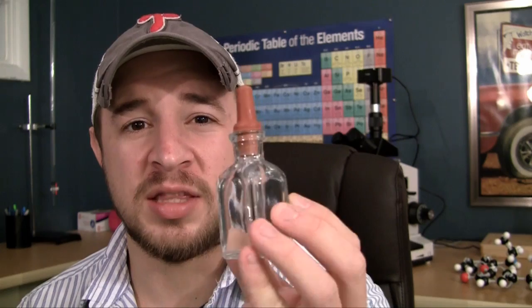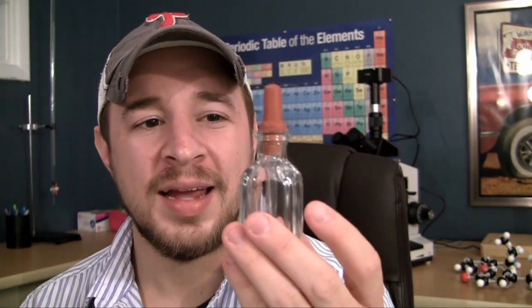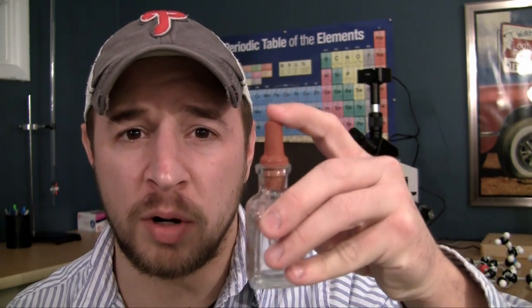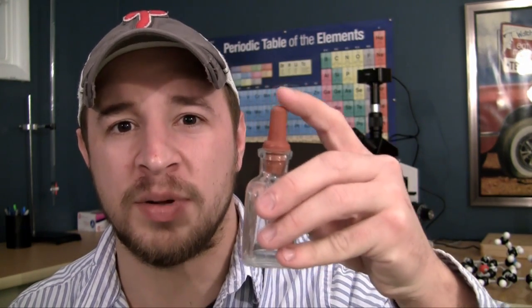Now you guys have probably seen this before but you may not know exactly what it's used for and it's easily identified because it has really thick glass walls in comparison to the other glassware we typically use in chemistry lab and it also has a rubber bulb or a rubber stopper on top and I'll talk to you guys about why it has this in a little bit.